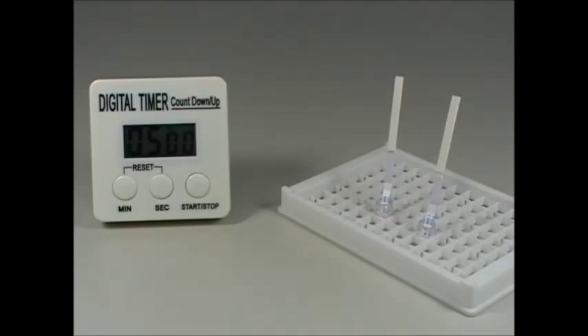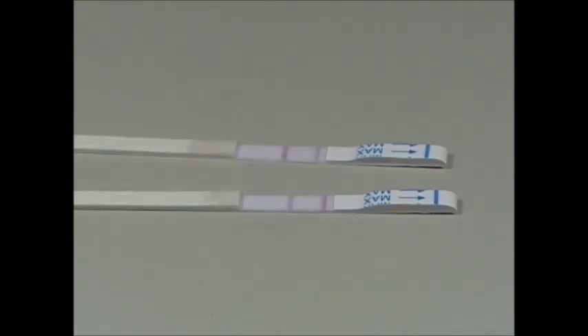Remove the strip from the microwell and interpret the results within 3 to 5 minutes according to the instructions given in the manual.